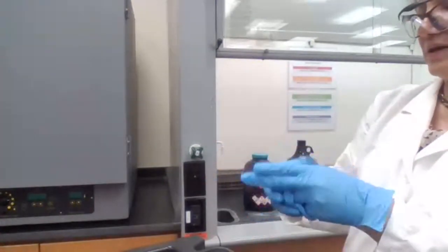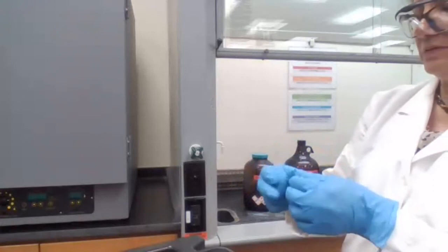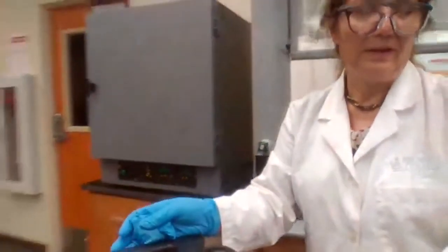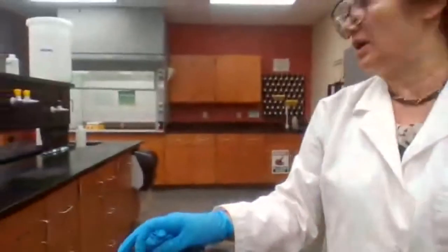It's not like a doctor's office, where as soon as you leave one patient, you have to change gloves. Here, you can keep your gloves on until it changes color.